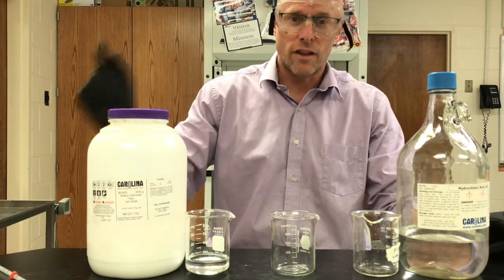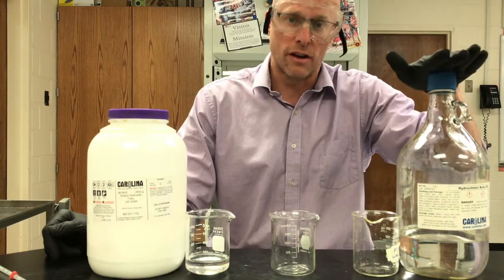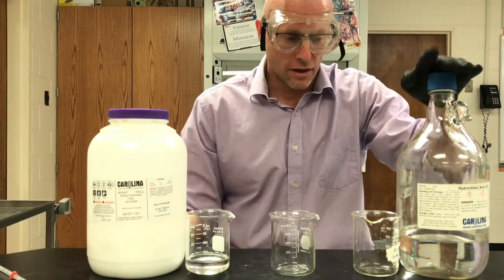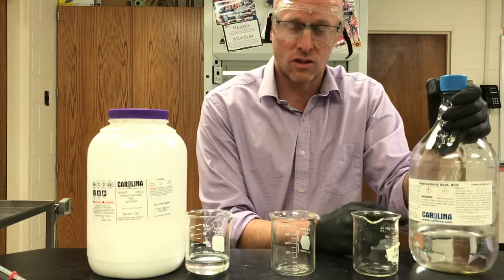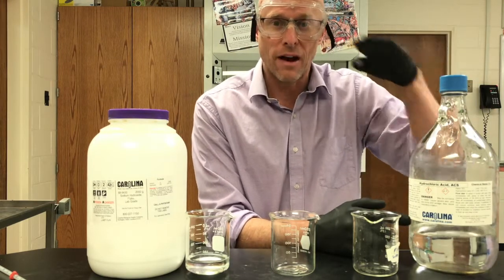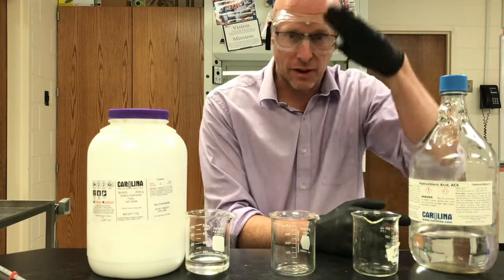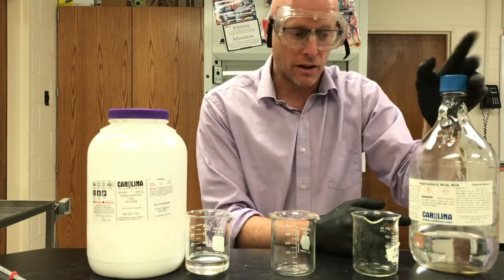Don't try this at home. I've got super concentrated hydrochloric acid — the concentration is about 12 molar, which puts it at a pH of about minus 1. You can go off the scale; this is so acidic that it's below the regular pH scale.